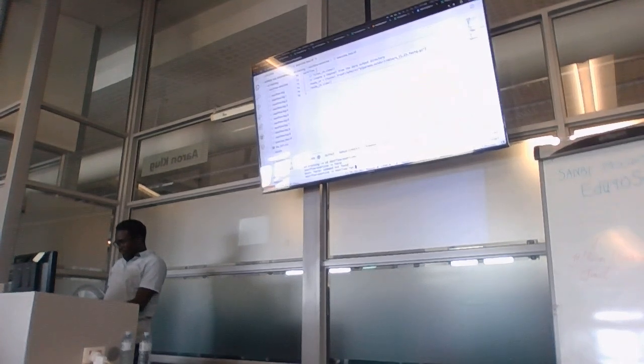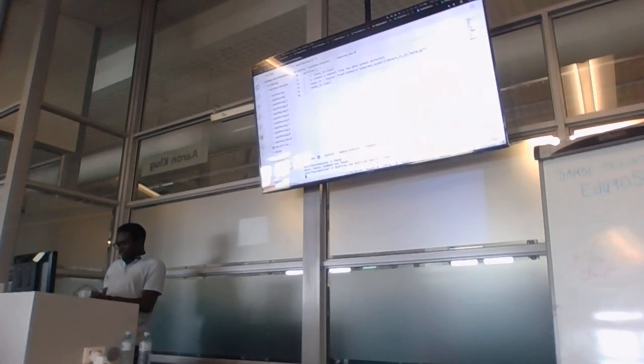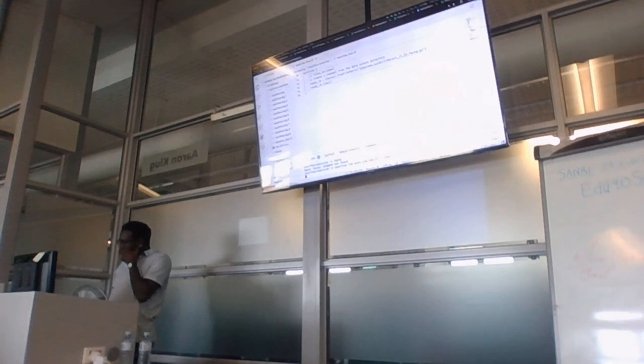Next program, how did I call the script? Exercise 2, illustration input. I'll do resume, 7.1.